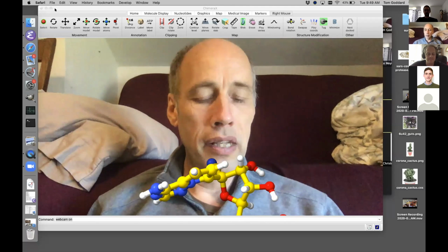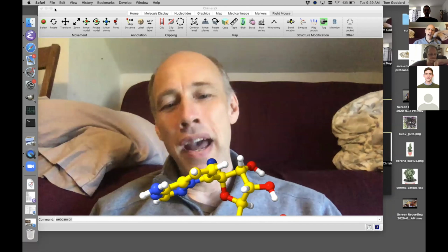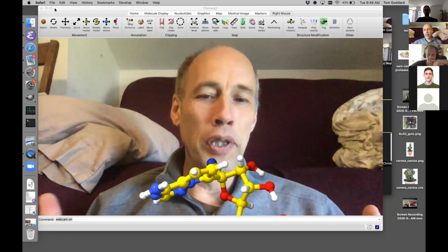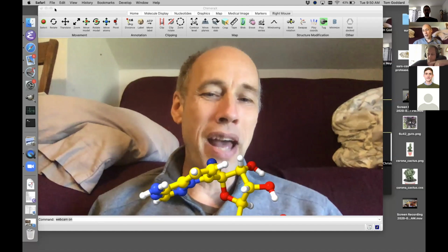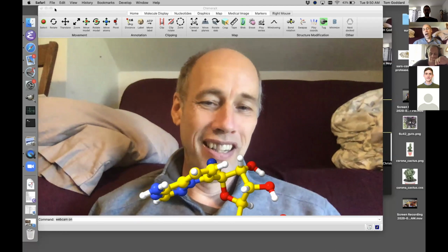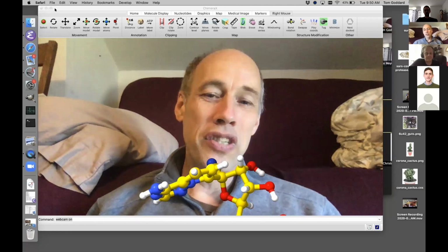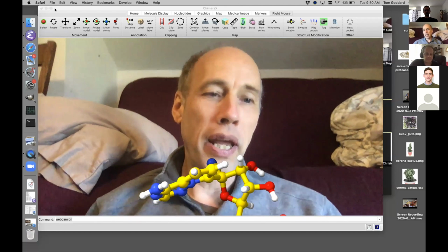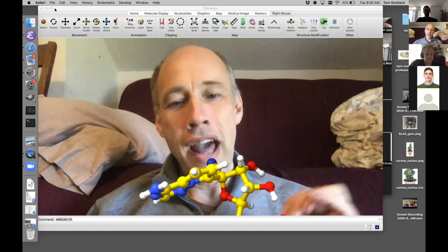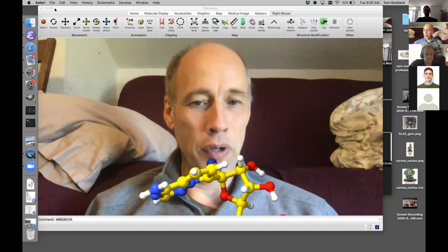But probably, when I did it on the Mac and asked for RGB, red, green, blue video format, maybe only Mac provides that. Apple likes to do everything different, right? The rest of the world might be using this YUV color space for their video. So hopefully when I add the YUV color space, both Windows and Linux will work with this webcam AR capture.